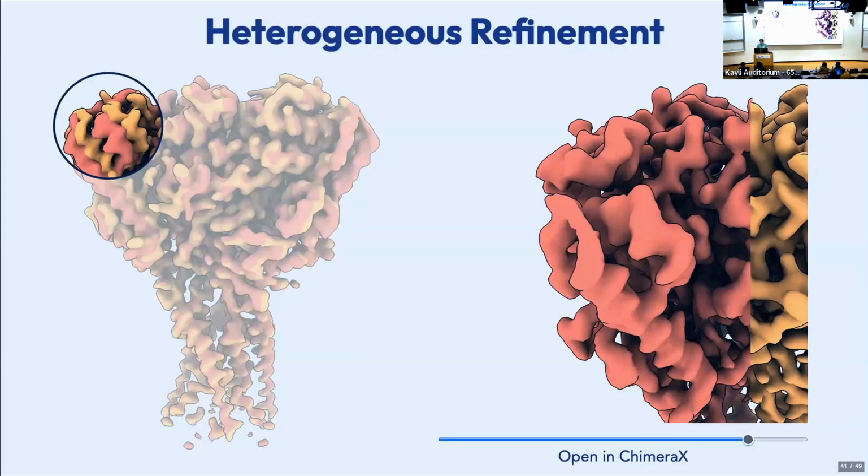One more thing, going back to the original design of this experiment, if there was one grid that was APO, and you solved the APO structure, you would answer a lot of these questions about the relationship of APO to the bound form. Where here you've mixed them, and you're depending on CryoSPARC to tell you where is the APO. Designing the experiment, doing the control. Right.